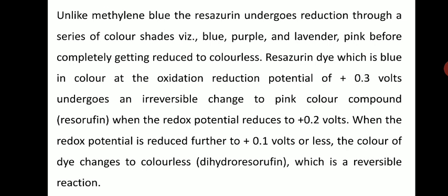In this particular test, the reaction again depends upon redox potential or oxidation reduction potential. Initially the redox potential is higher, and as the dye gets decolorized, or as the incubation period goes on, the redox potential gets reduced in a stepwise manner, and we can see different shades of color as the redox potential changes.